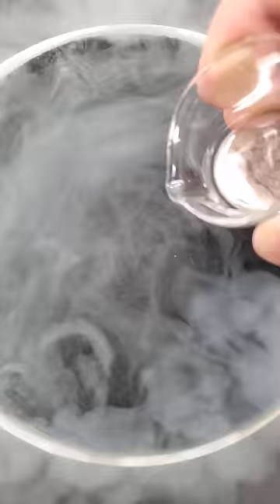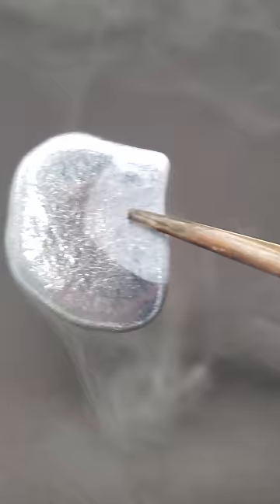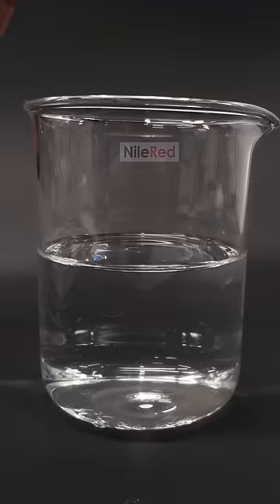It looks like it's good to go, and I can pour in some of the mercury. This is a few minutes later, and it's definitely solid. I really have no idea what to do with it though, and I think it might be cool to just melt it again.